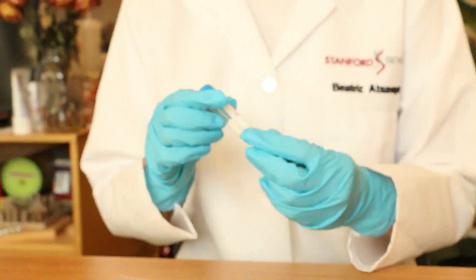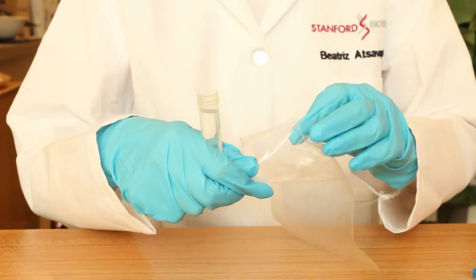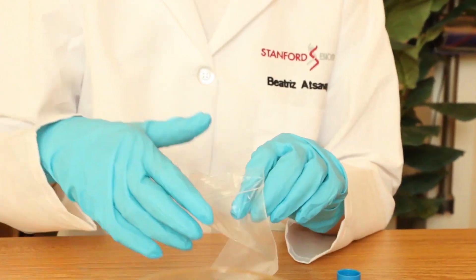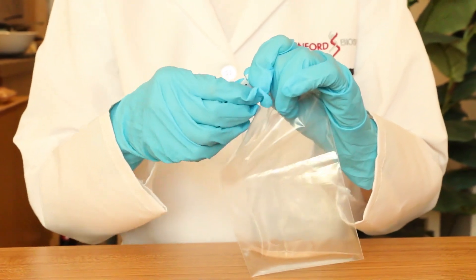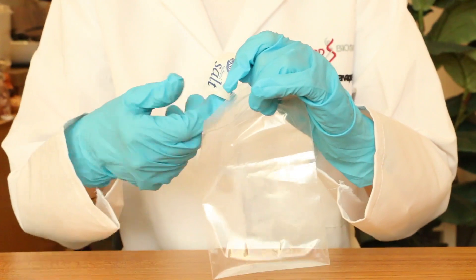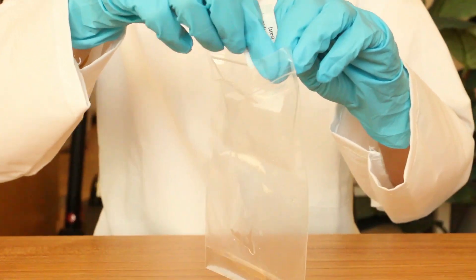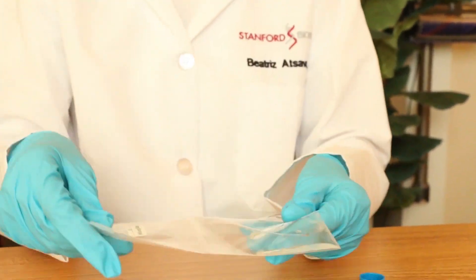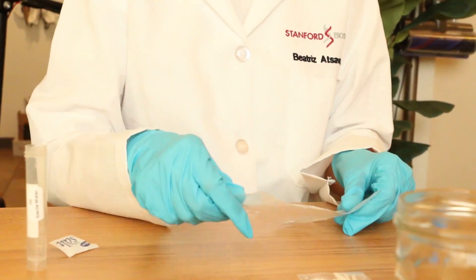The first step is to make a saline solution. In this resealable bag, we're using a tablespoon of distilled or bottled water, since tap water has salts and impurities that could interfere with the experiment. Now we're going to add this packet of salt, which has about one quarter teaspoon. This salt will bind the DNA and help separate it from the other cellular components and molecules in the strawberry. Now we'll just seal this and mix it up.